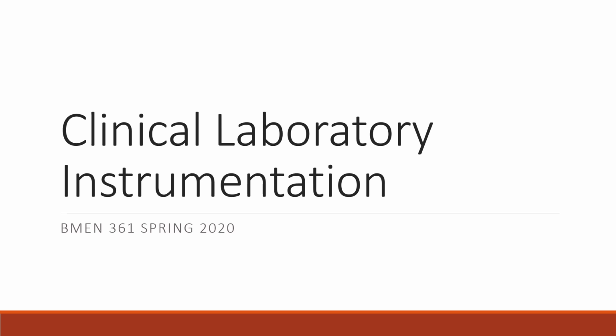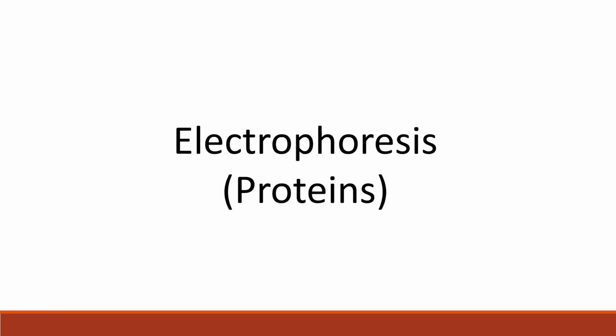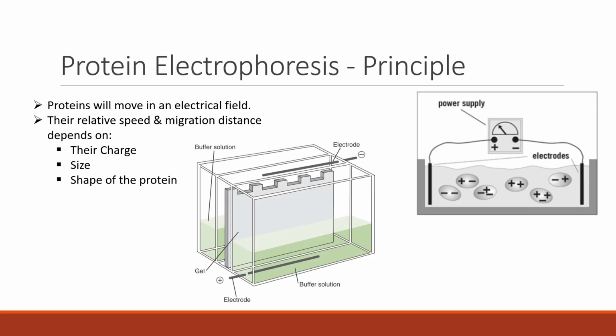Hey guys, welcome back. If you remember last time, we were talking about DNA electrophoresis and how we can use it to separate nucleic acids according to their molecular weight. I want to continue that conversation and talk about how we can use electrophoresis to separate proteins as well.